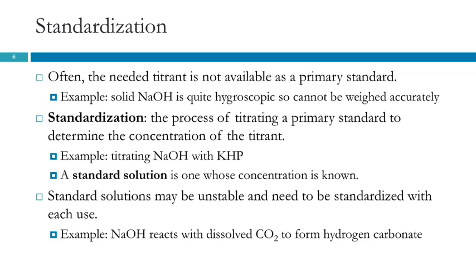Once you've standardized the sodium hydroxide, it's considered a standard solution. With sodium hydroxide especially, unless you take some significant precautions, which is what we tried to do in Chem 1B. I'm not sure how successful that was, but we boiled the water to get all of the dissolved gases out.